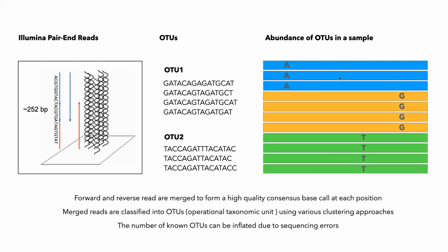As a result, we can sequence these regions and get those sequences organized in a single sample, right? That single sample is characterized by differences between these operational taxonomic units, because we don't want to look at each individual variation, each mutation. So we group them by similar number of mutations so that they form groups.